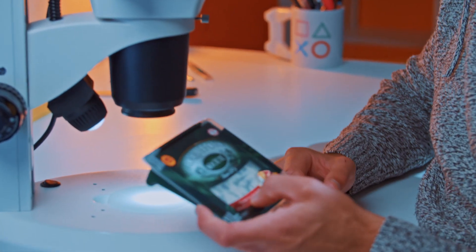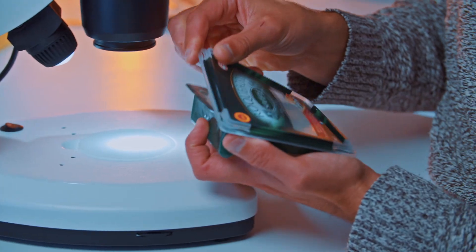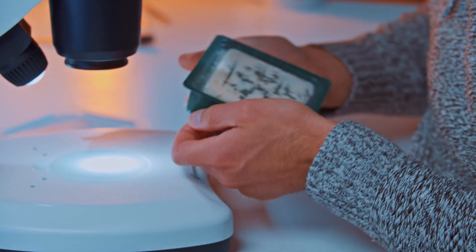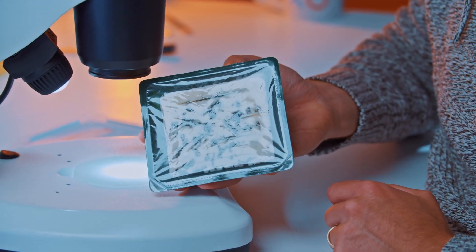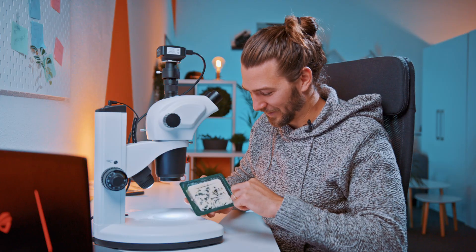Hello guys, welcome to Small Turns Big where we turn small things big. Today we're looking at mold cheese, in particular one brand, Roquefort. Let's unpack this and have a look at it under the microscope. You can see there's a lot of mold going on there. Let's open it up here.